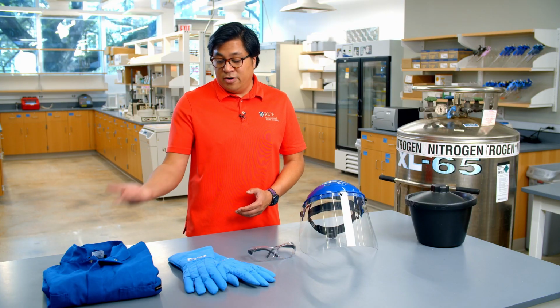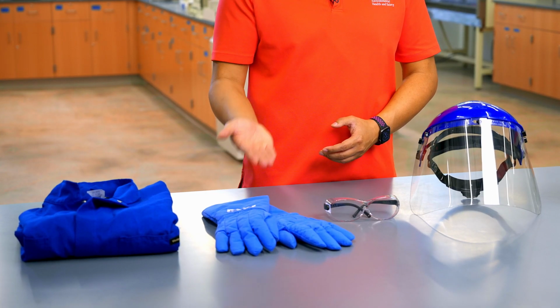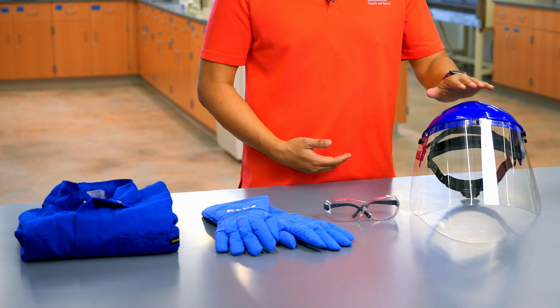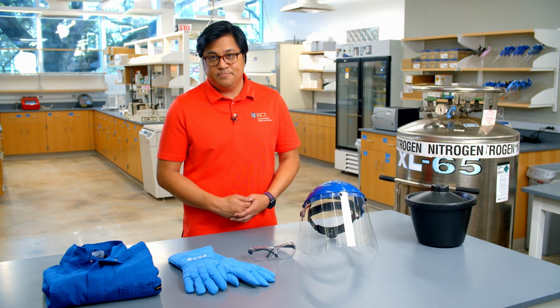materials safely. Without the proper PPE, all cryogens can cause significant thermal burns. At the minimum, you should be wearing a lab coat with closed-toe shoes, thermally insulated gloves, safety glasses, and at times a face shield. Once you have all these on, you're ready to begin.